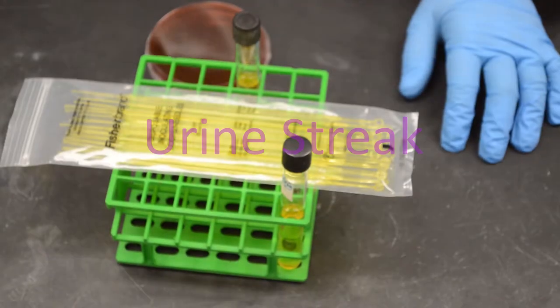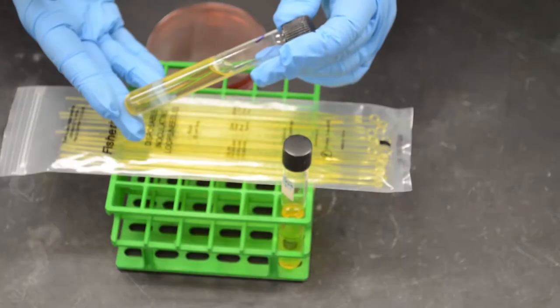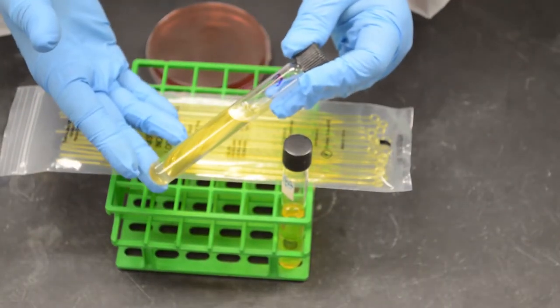The urine streak is a semi-quantitative method of determining an approximate number of bacterial cells in a fluid.